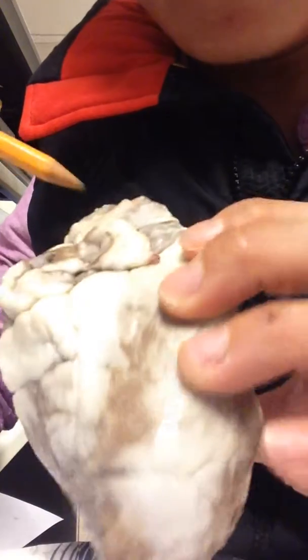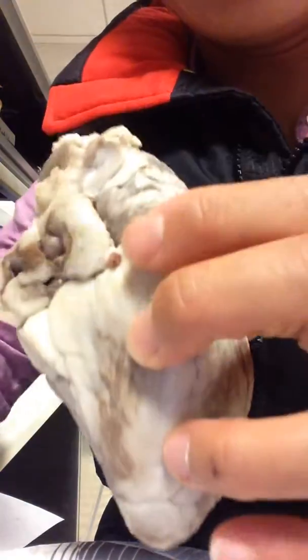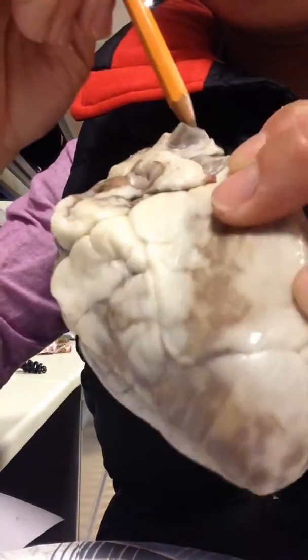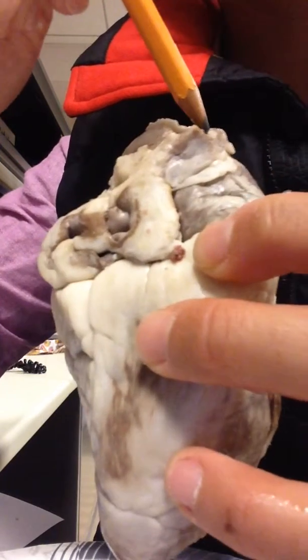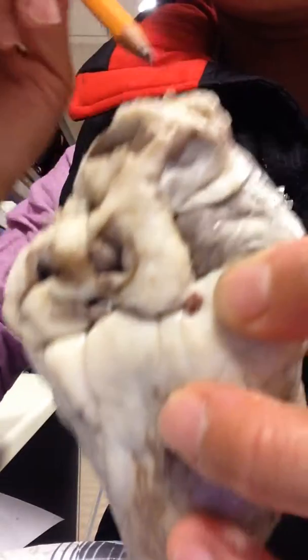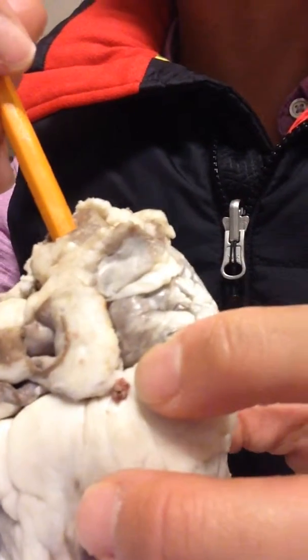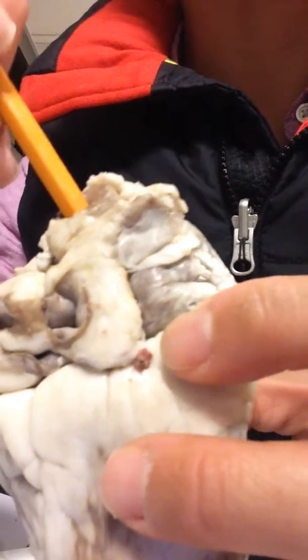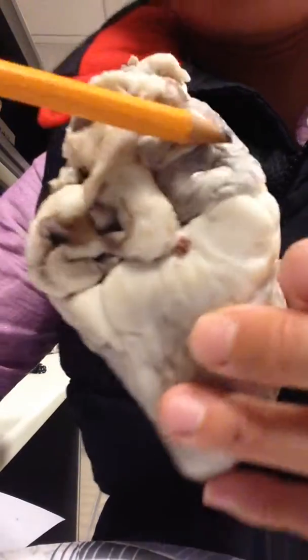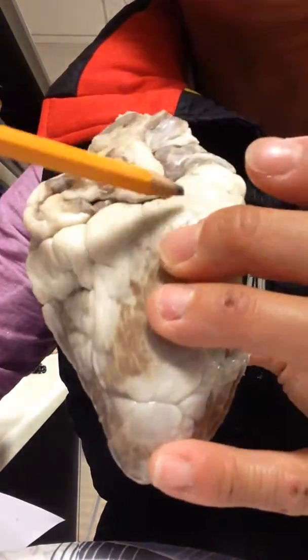And then the inferior vena cava is the one on the bottom, which I don't see. So I think it's this one. Is it? No, it's the further left one. I honestly don't see it. So I found those three major vessels. It's along this region. Upper, and then the inferior is below it.